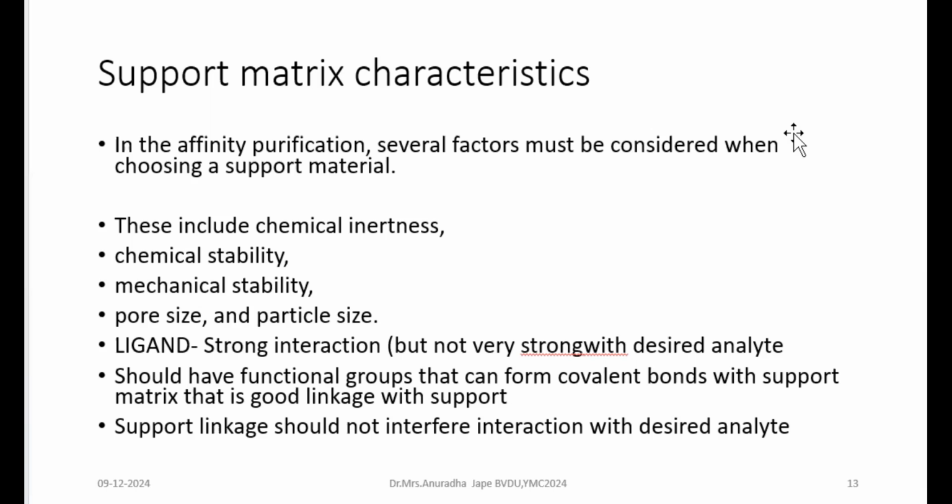Of course, polyacrylamide beads are better, and they fulfill the desired criteria, but they also have a problem, that is the porosity is less as against that of agarose. So it is important to substitute it with ligands.